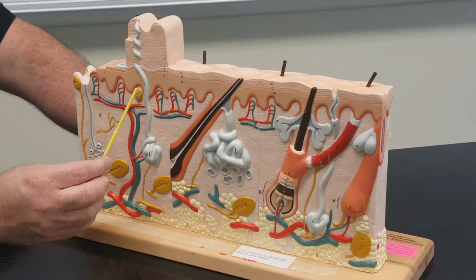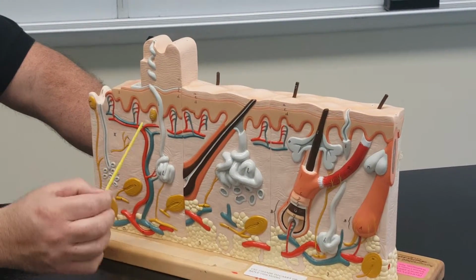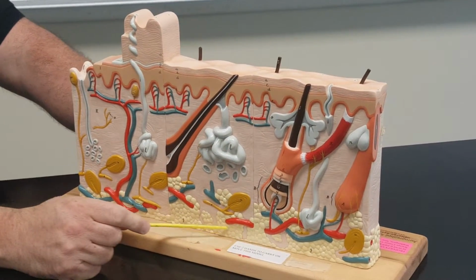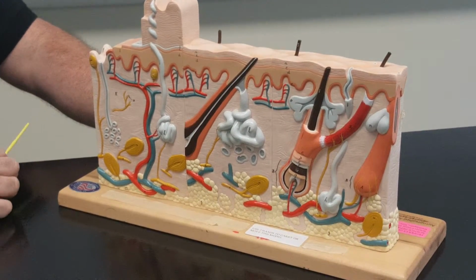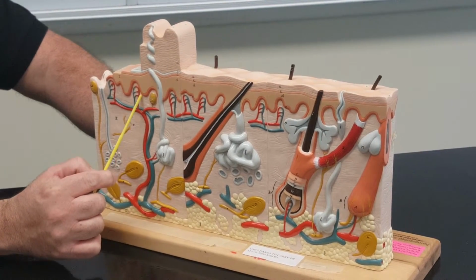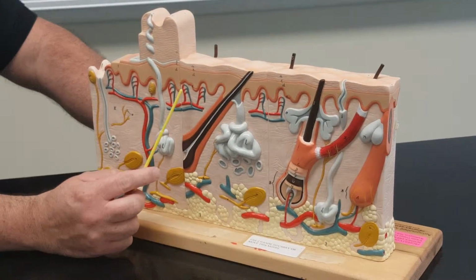As far as the skin is concerned, as far as the dermis layer, so we have the epidermis, the dermis, and then the hypodermis, aka the subcutaneous layer. So here's all representing of the subcutaneous, aka the hypodermis layer. Okay? So the dermis has these dermal papillae. See these pegs? Dermal papillae. Right here.